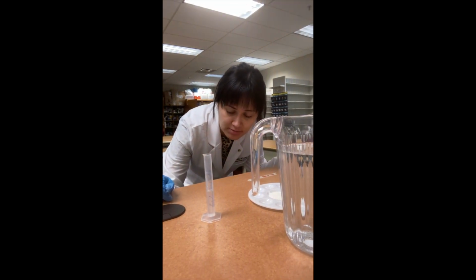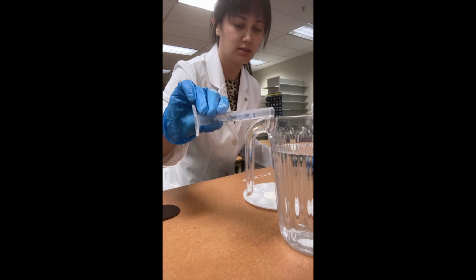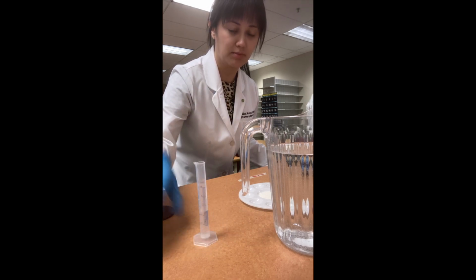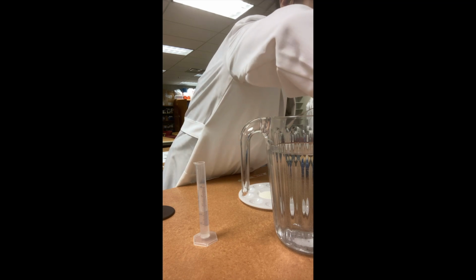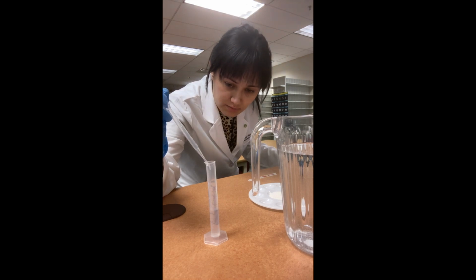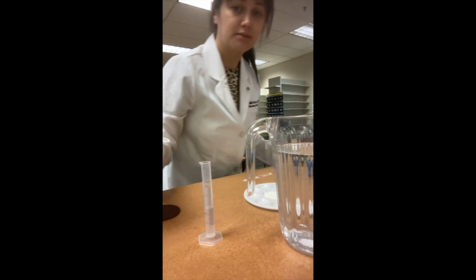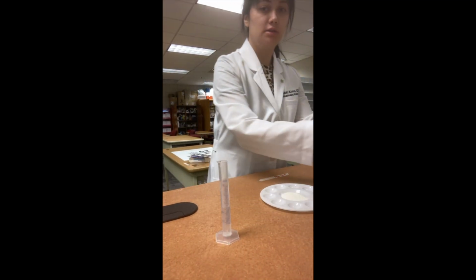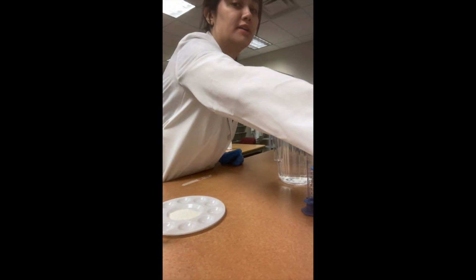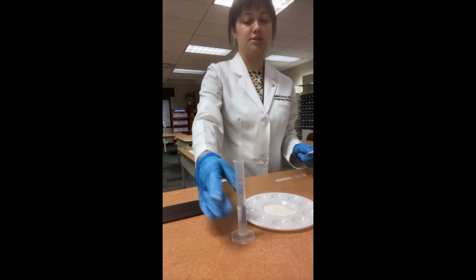So looking at this, I can see right now that I have a little bit more than I need. So I'm just going to put it just a tad back. I think that was a little bit much, yeah. Now we're just going to put just a little bit in there until we get right at that 6th line. There we go. Perfect. So now I have my powder. I'm going to grab a knife right now, which will represent my spatula. And I'm going to slowly pour my water in.